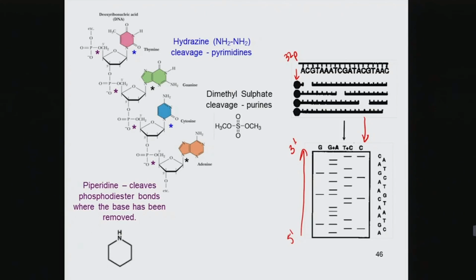Okay? So this procedure is typically not done anymore in the lab. I mean, this compound is very, very toxic. It's highly combustible. It's known to be carcinogenic, so I definitely wouldn't want to be working with it in the lab. But again, just to show you what types of techniques they were working with in the early days to sequence DNA.